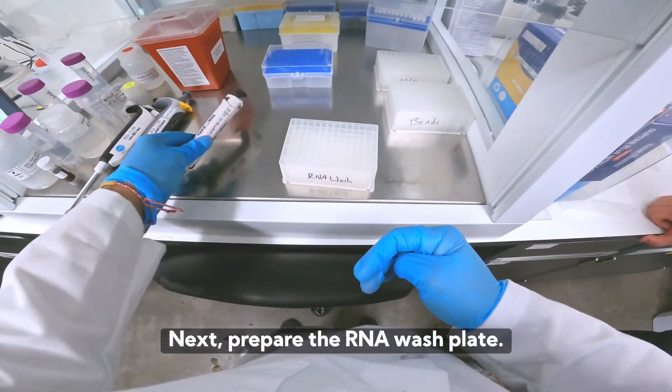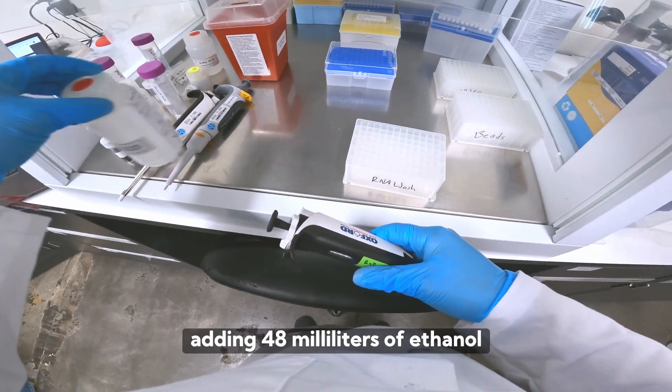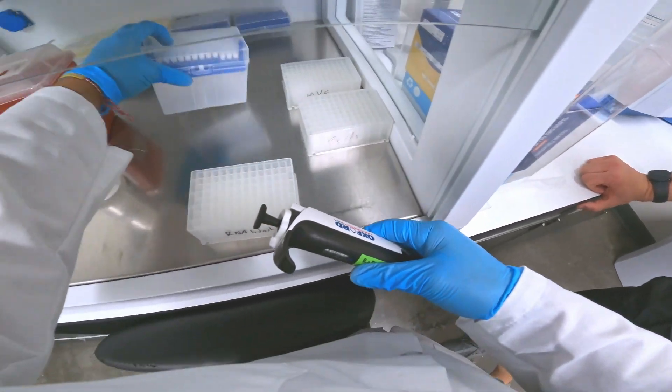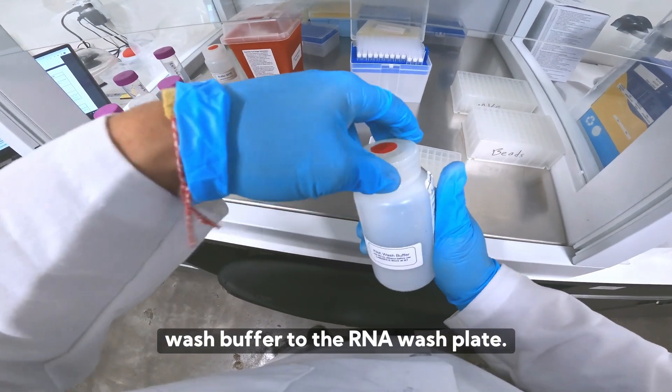Next, prepare the RNA wash plate. The RNA wash buffer must be prepared by adding 48 milliliters of ethanol to the bottle before use. Then add 500 microliters of RNA wash buffer to the RNA wash plate.